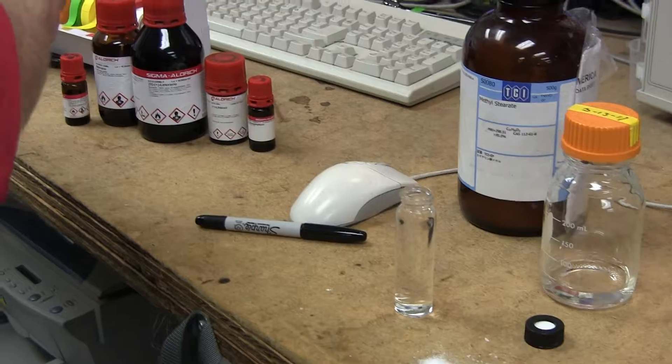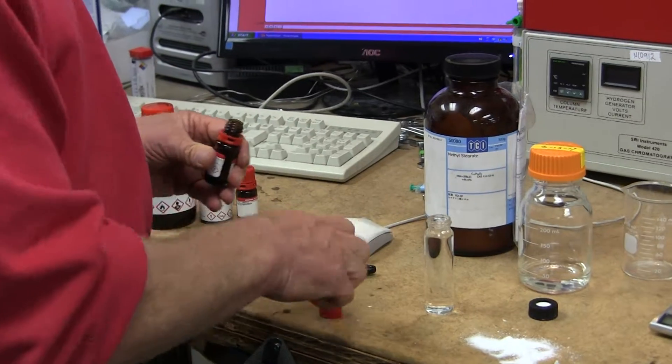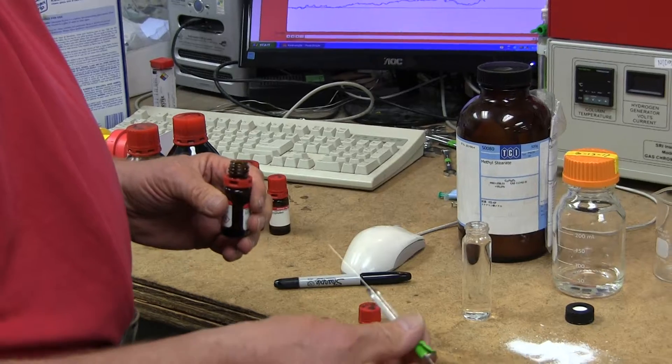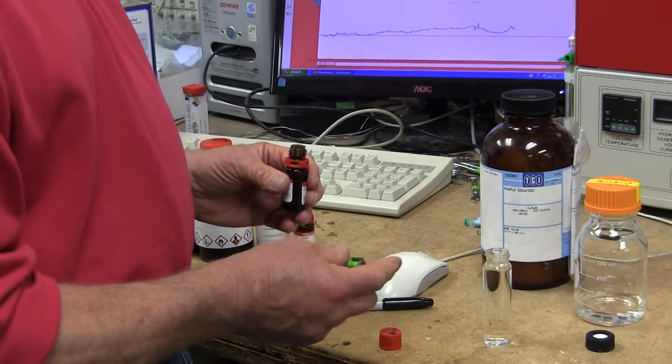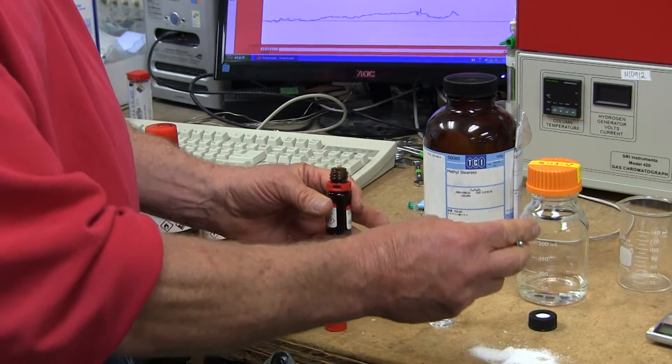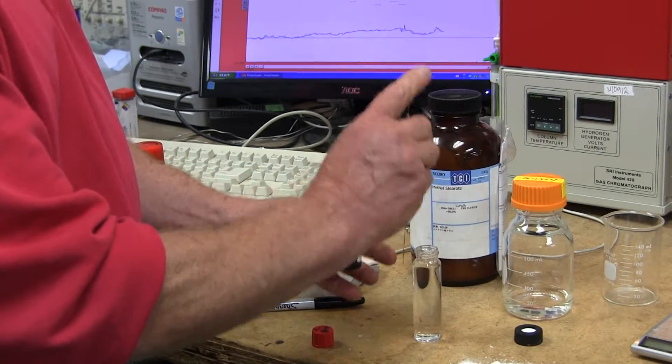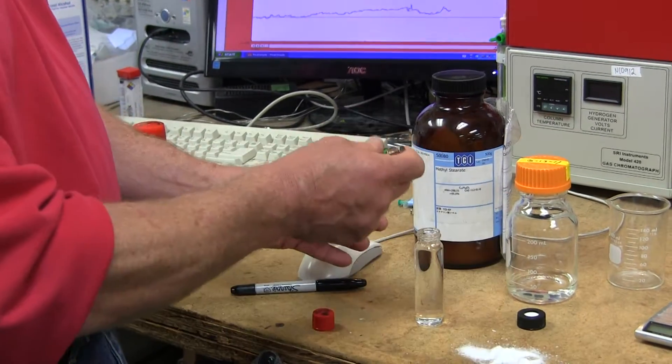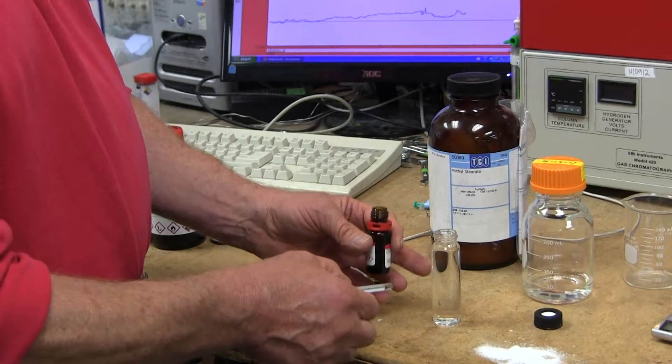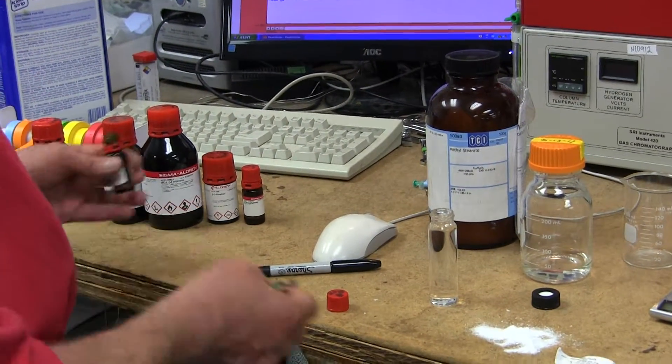Alpha pinene weighs about 0.8 times as much as water does, so four microliters weighs about 3.2 milligrams since a microliter of water weighs a milligram. When I put 4 microliters into 40,000 microliters, I'm dividing the pure alpha pinene by 10,000 times. So I know this particular internal standard solution now contains a known weight of alpha pinene.